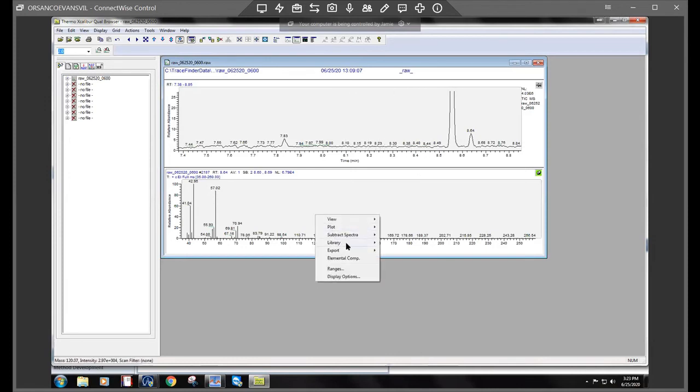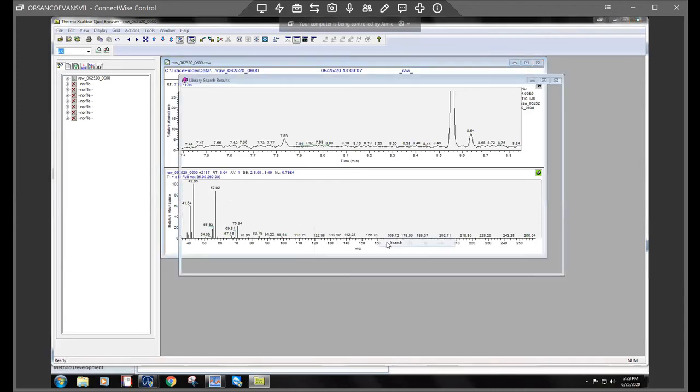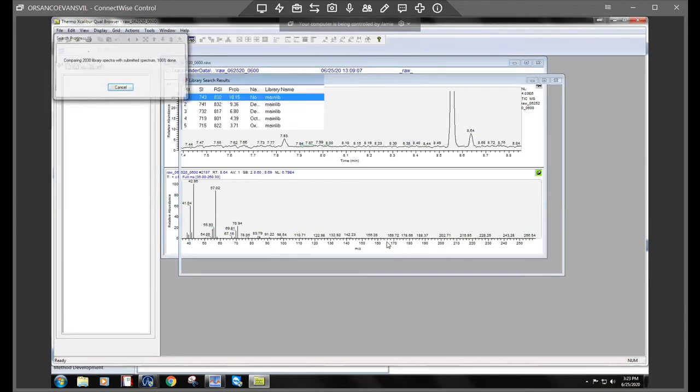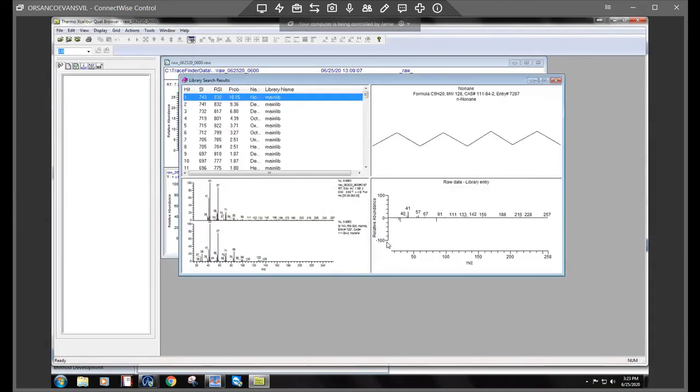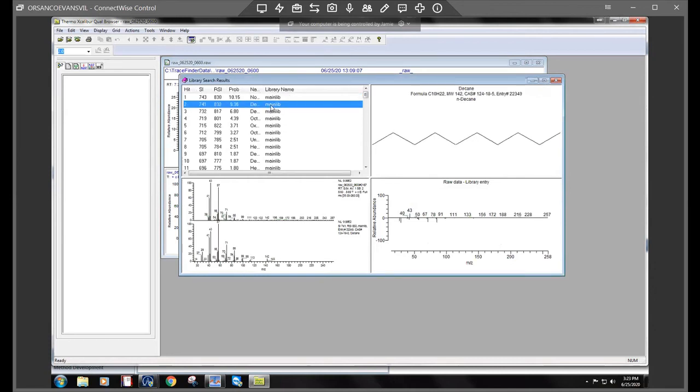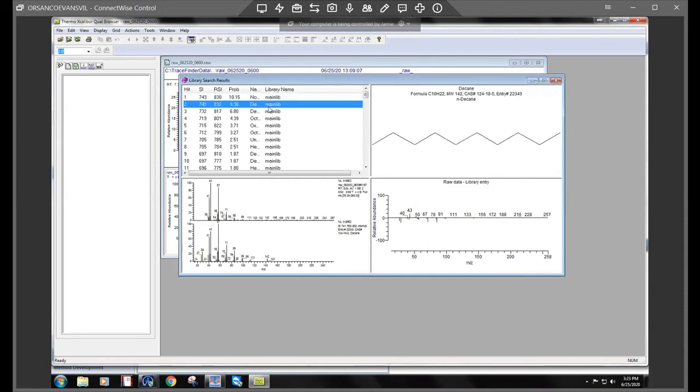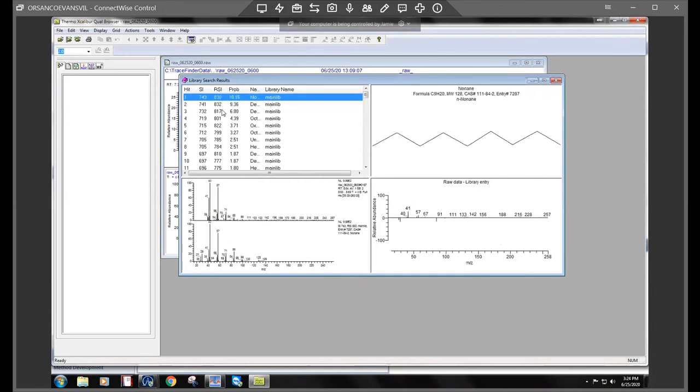So what that did is it took this current spectra and it subtracted whatever it's finding within this baseline. So then I'm going to go ahead and do a library search again. Sometimes it changes and sometimes it doesn't.